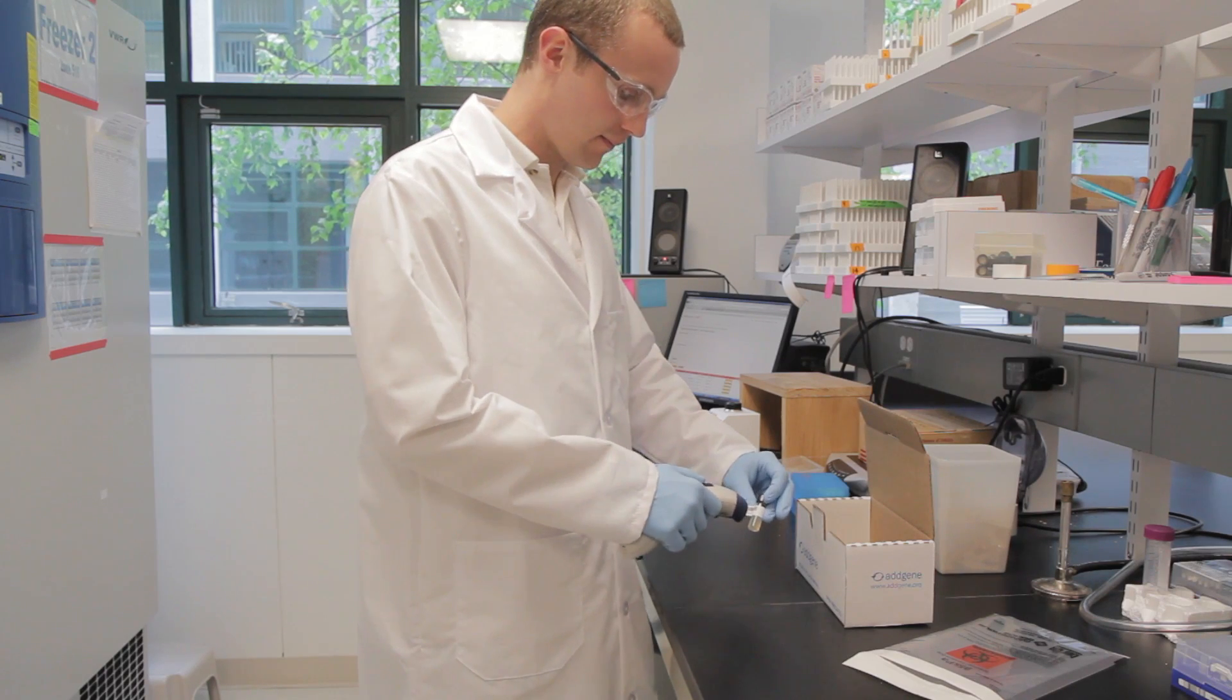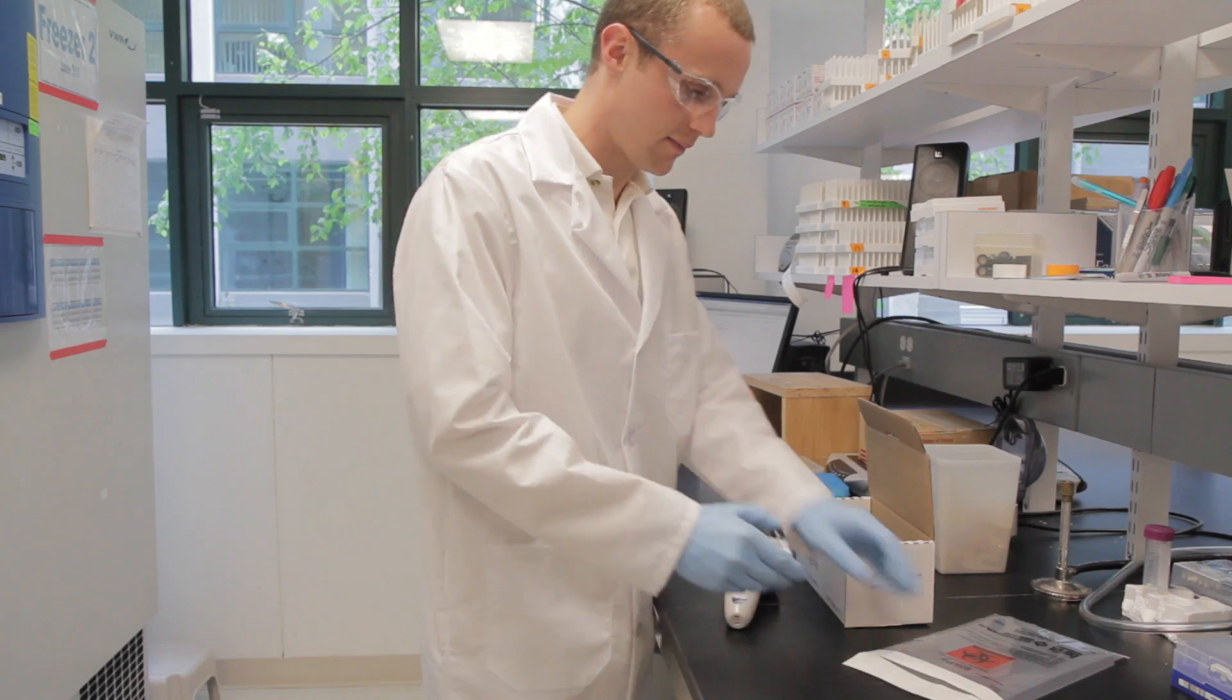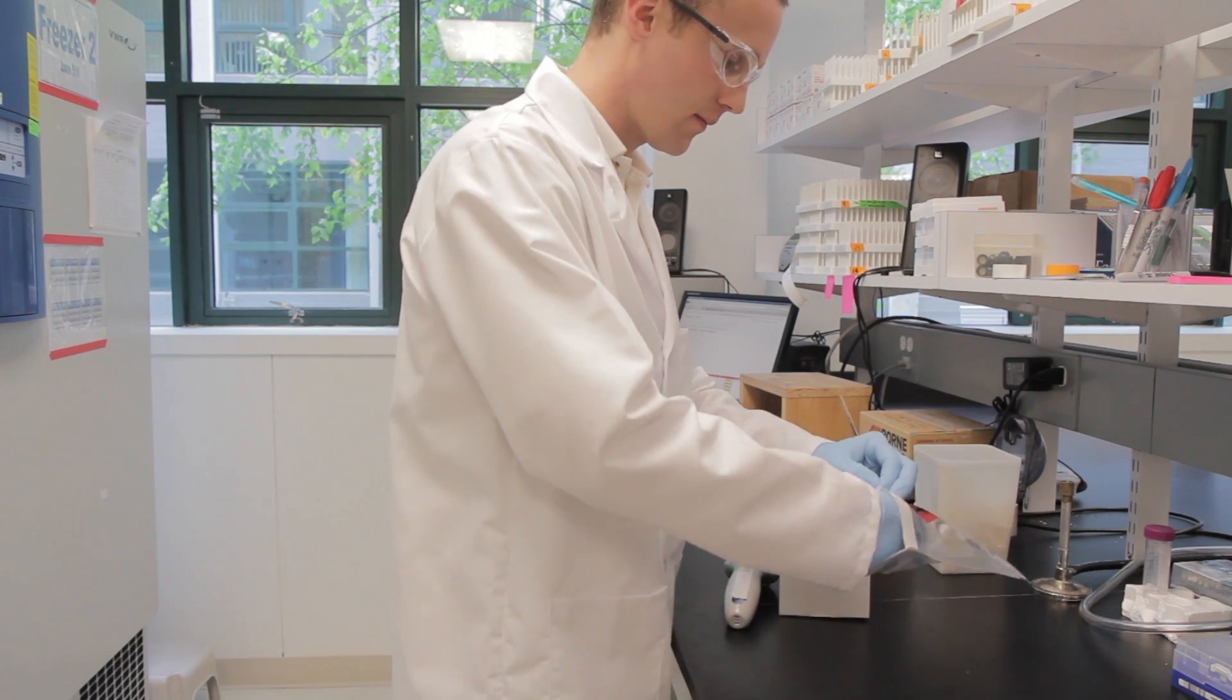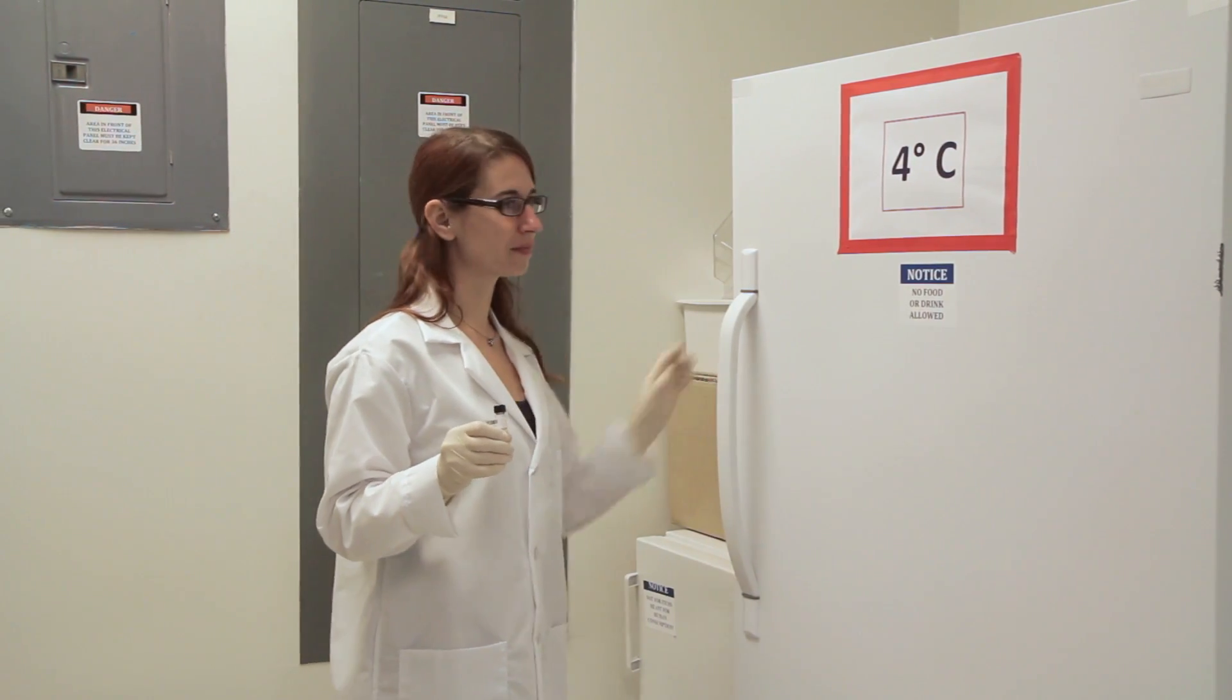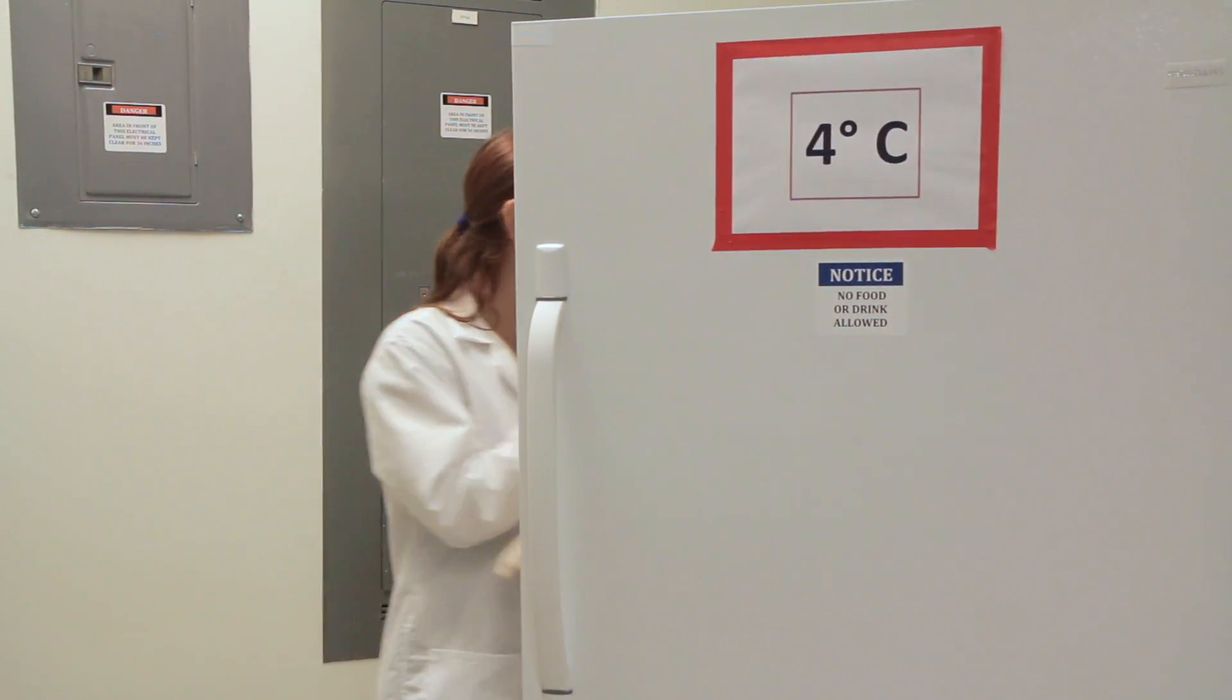The barcodes on the stabs are scanned again during packaging to ensure that scientists receive the correct samples. Upon receipt of your bacterial stab, you should store your sample at 4 degrees Celsius.